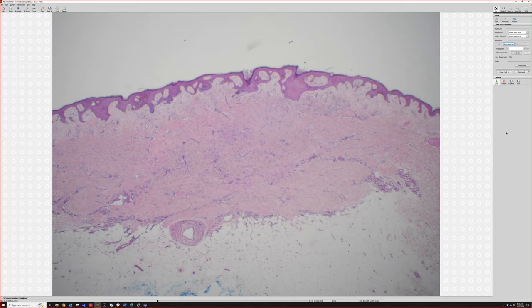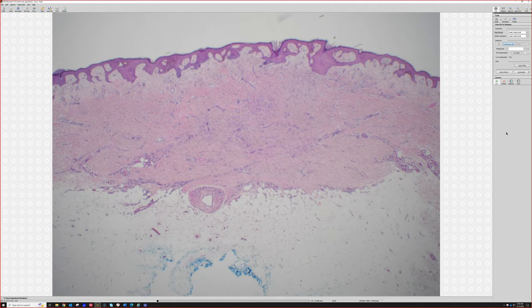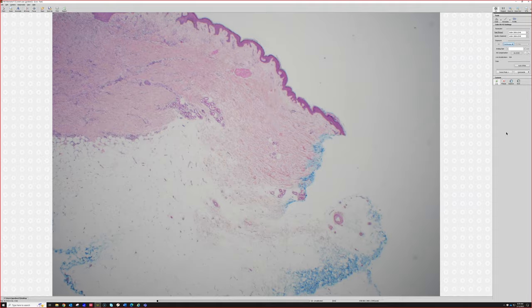Now, how about this one? Here's the normal dermis here. Sometimes it's helpful to see the normal dermis and then the abnormal dermis. Because sometimes dermis is hard to evaluate the collagen and the cellularity unless you have normal to compare it to at the side. With practice, you can recognize it. But even for me, if I get a punch of all abnormal dermis, if it's subtle, it can take me a few seconds to pick up on it when I first look at the slide. And then I'm like, wait a second, this dermis is kind of weird. But it's a lot more noticeable when you can see the normal collagen pattern and then this.